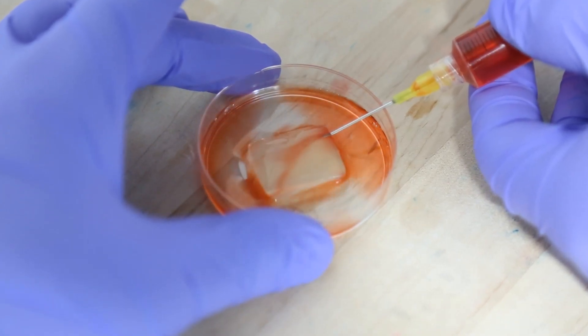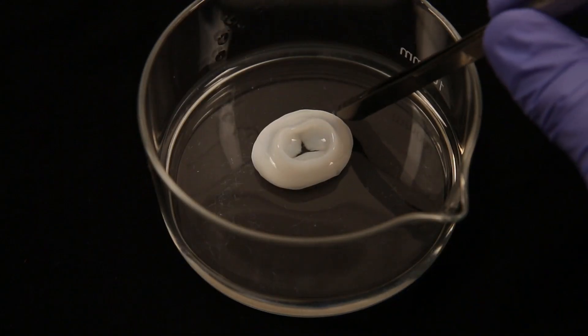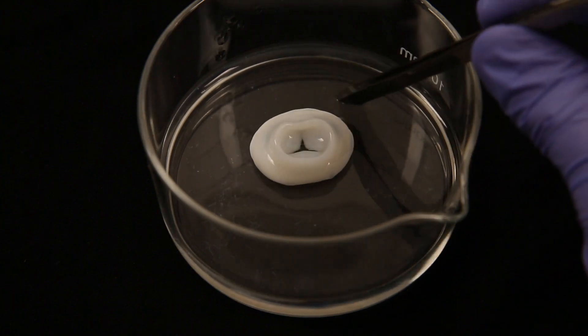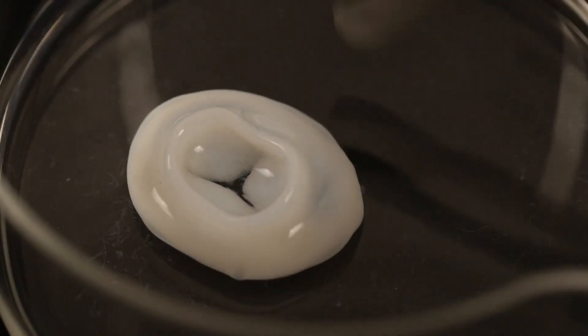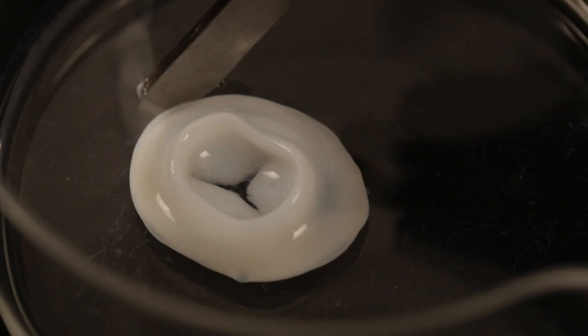We've even created a small ventricle made out of human heart muscle cells. We can recreate things like decreasing the size of the chamber during the heartbeat, thickening of the wall, and having a nice induction of electrical activity around the ventricle during each beat.